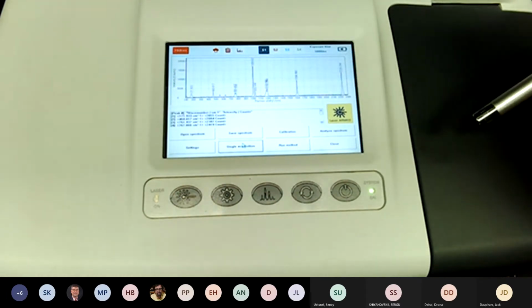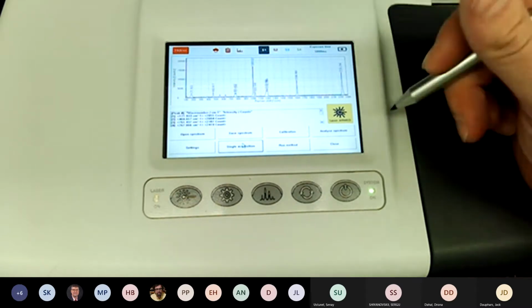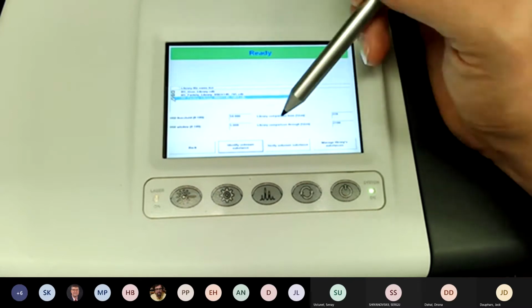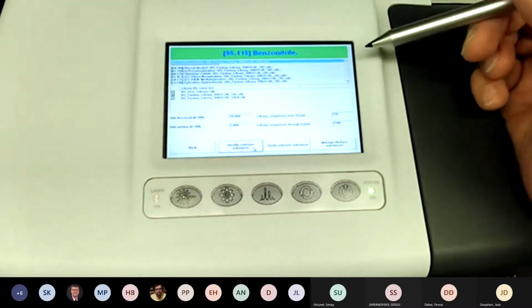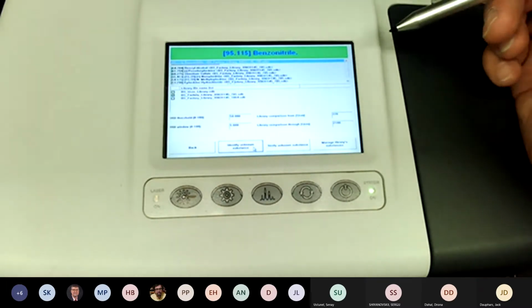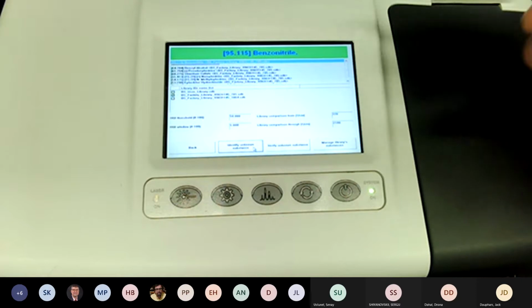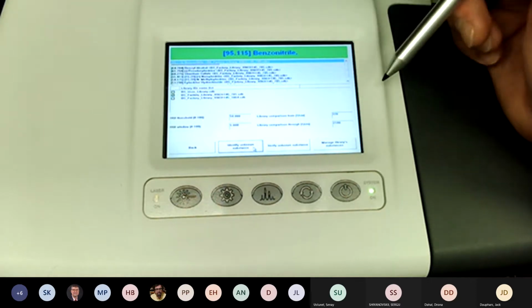Okay, so this is the benzonitrile standard, which is used as a calibration standard. We're going to see if that gets it better. I don't know why the polystyrene is suddenly showing up as... so this is a 95% match to benzonitrile. I have to look at that polystyrene. It was matching it like 95 to 97% earlier, and now it's calling it something different. Maybe there's something on my hands that I touched.